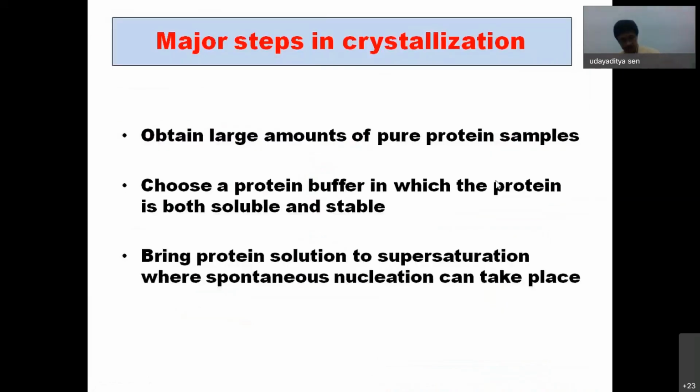So how do we crystallize? Why are we talking so much about crystallization? Because as I told in previous slides, you need a crystal for X-ray diffraction. So without any crystal, you cannot do crystallography.